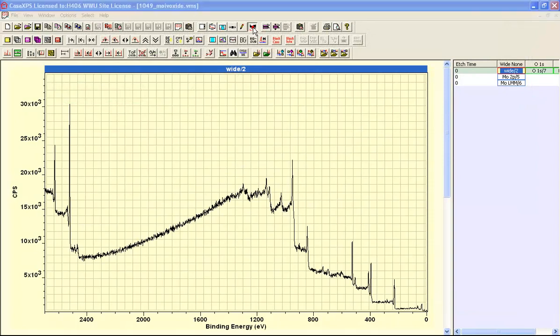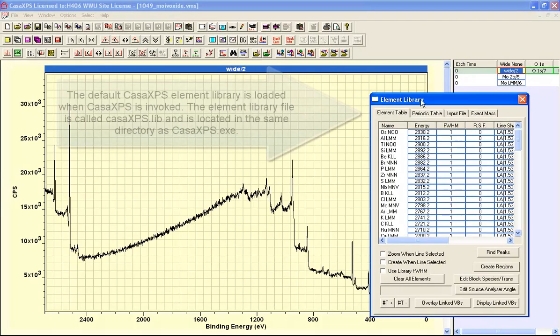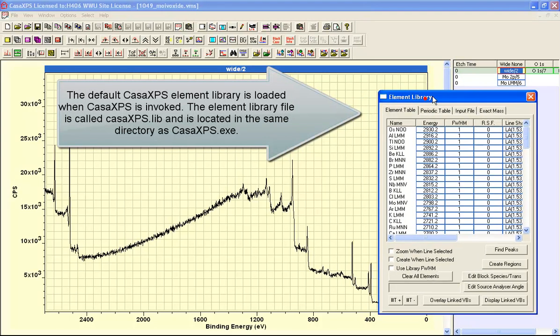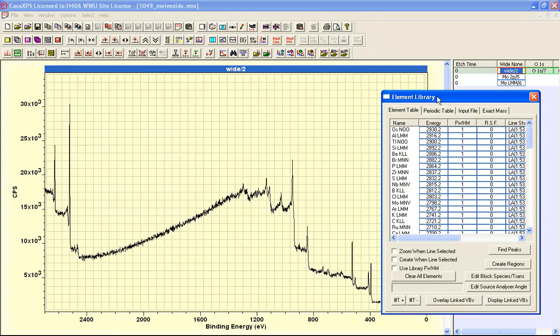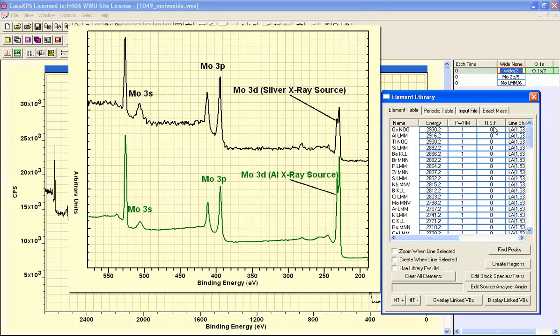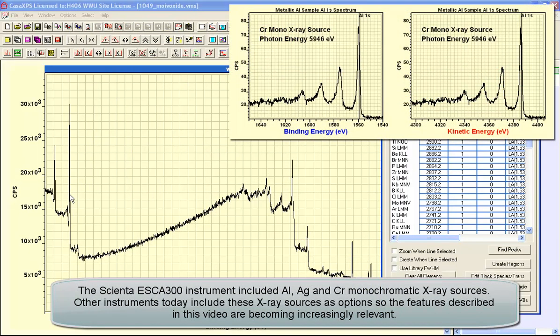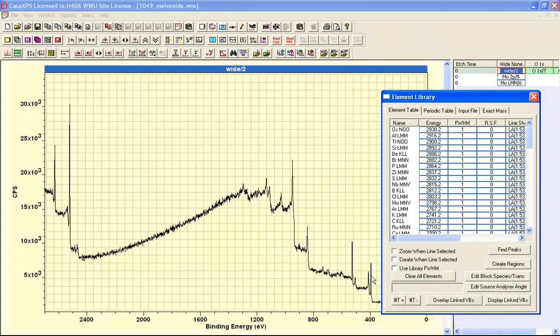The default element library in CasaXPS has been defined for aluminium and magnesium X-ray guns and the reason these libraries are defined in terms of the X-ray guns is that the photon energy determines the relative sensitivity for photoemission peaks. So if you change the X-ray source and therefore the energy of the X-rays then these photoemission lines all appear with different relative intensities and therefore the library needs to present the correct relative sensitivity factors for the given X-ray source.